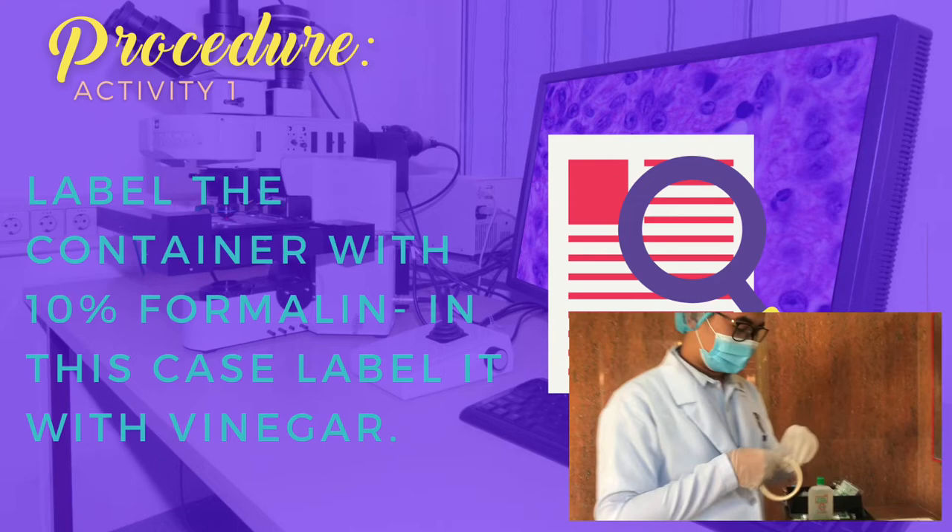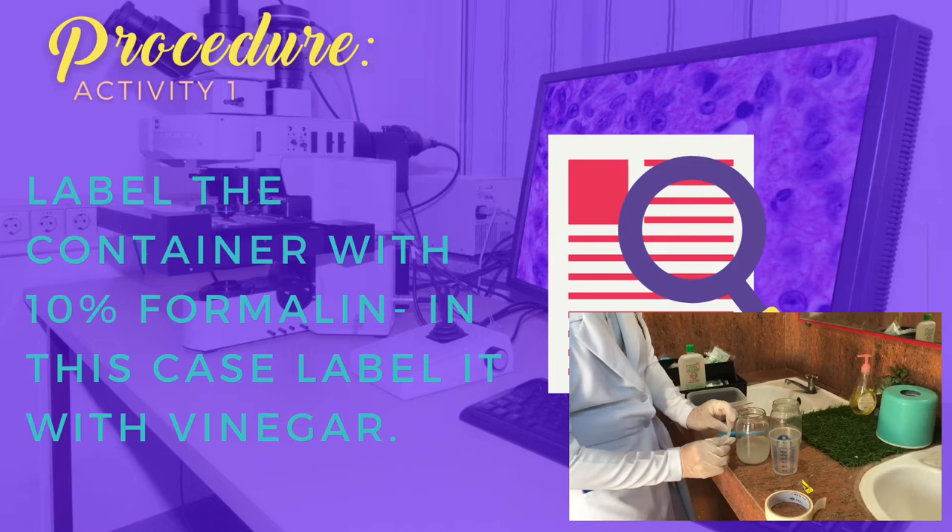Next procedure: label the container with '10% formalin' — and in this case, label it with 'vinegar' — using our pen and labeling tape.